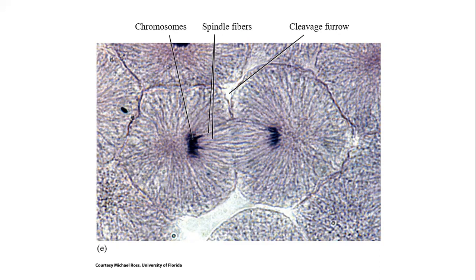So the model for mitosis that you have seen is called a whitefish blastula. Cell division occurs at a breakneck pace, and it's a really great model. Chromosomes stain dark blue or black, so it's really easy to see. This is why we use a whitefish and not human cells, for the visibility and the clarity.